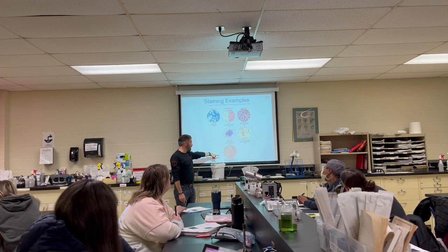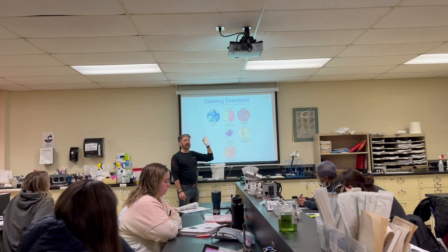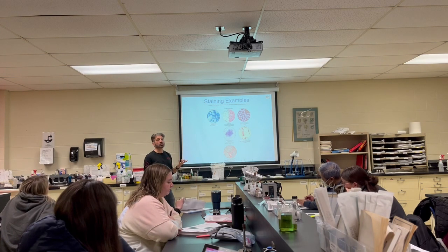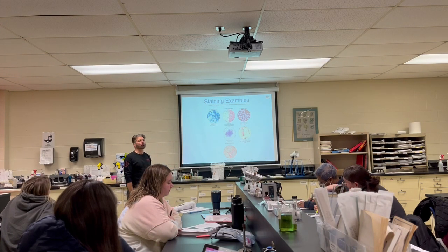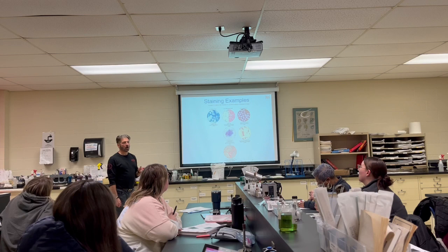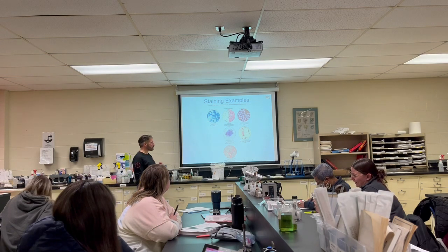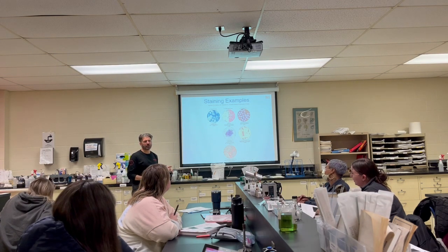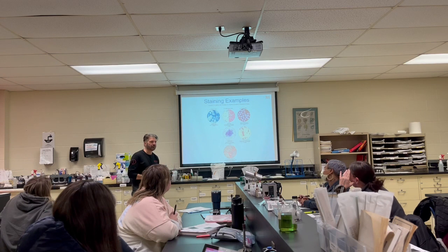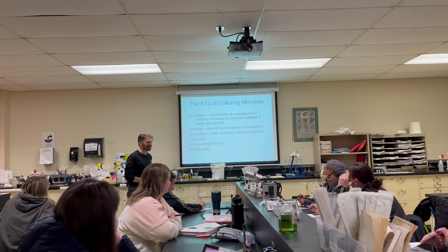And there's a spore stain. So these are hard. They usually don't work out. But you'll see little dots. Now I know that bacteria is a spore former. I know it's going to be really hard to kill. Does anybody remember the only way I can kill something with a spore? Autoclave, and what was the other one? Tyndallization? Or I can just get a flamethrower, right? I can just burn the heck out of it. She's like, yeah, Doctor, let's burn some stuff.